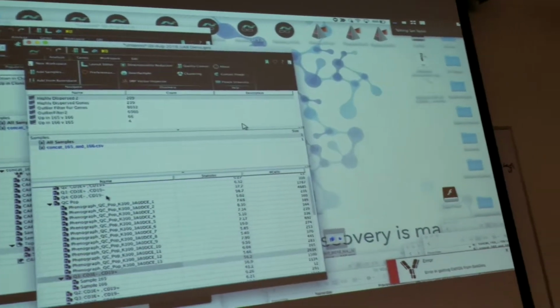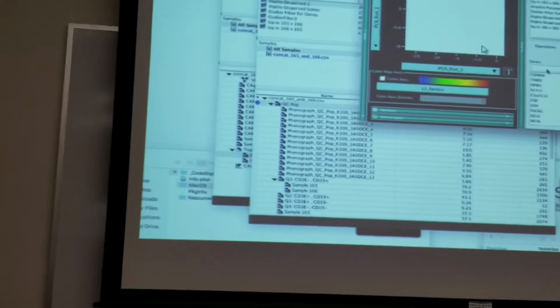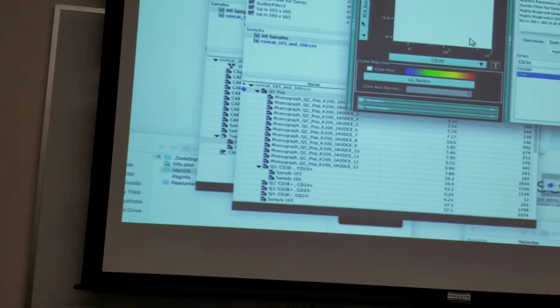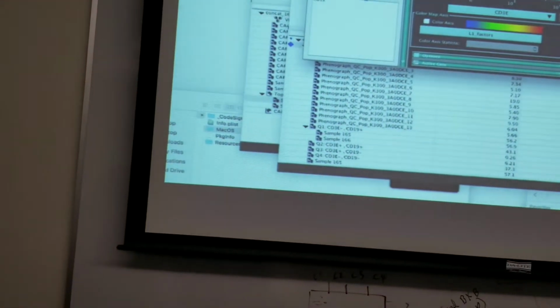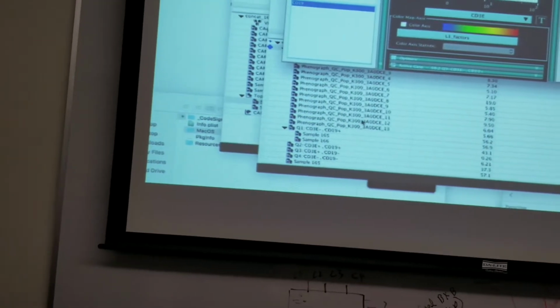Well, one thing I did is I replicated this. Well, maybe you can just go back to something that works. And I just would like to see how you go from there to look at just a few genes, V heavy and light chain genes, and then go over again how to export the cell ID. So, we can go back and look at the immunoglobulin.